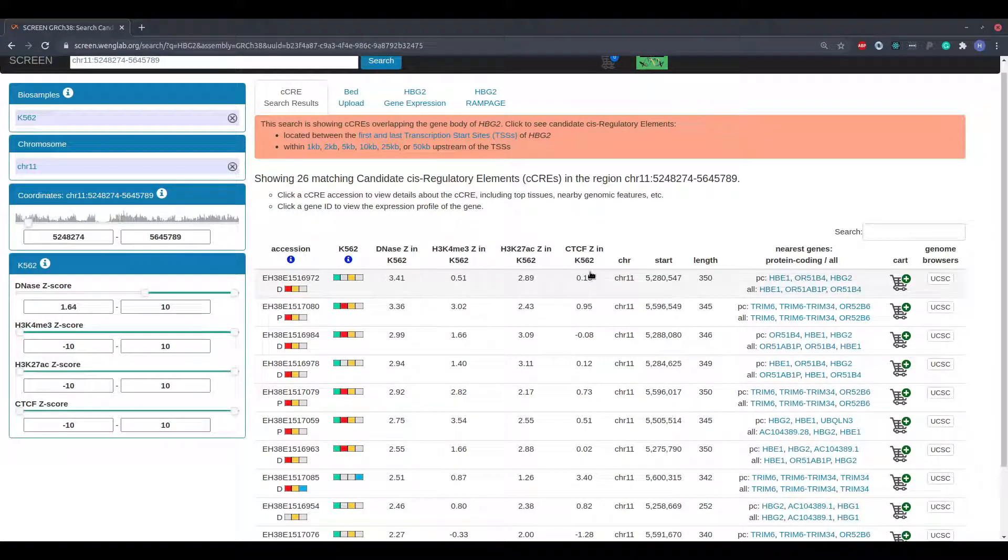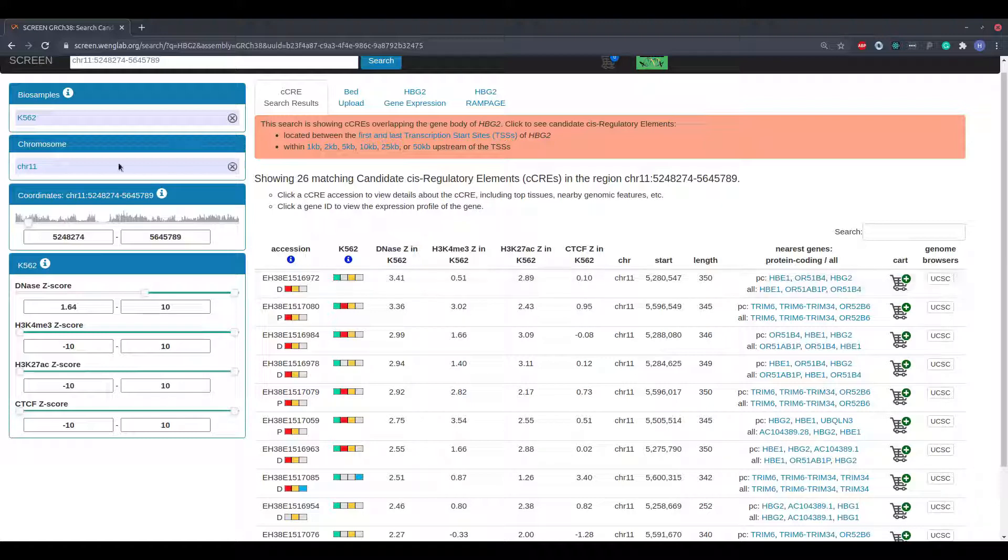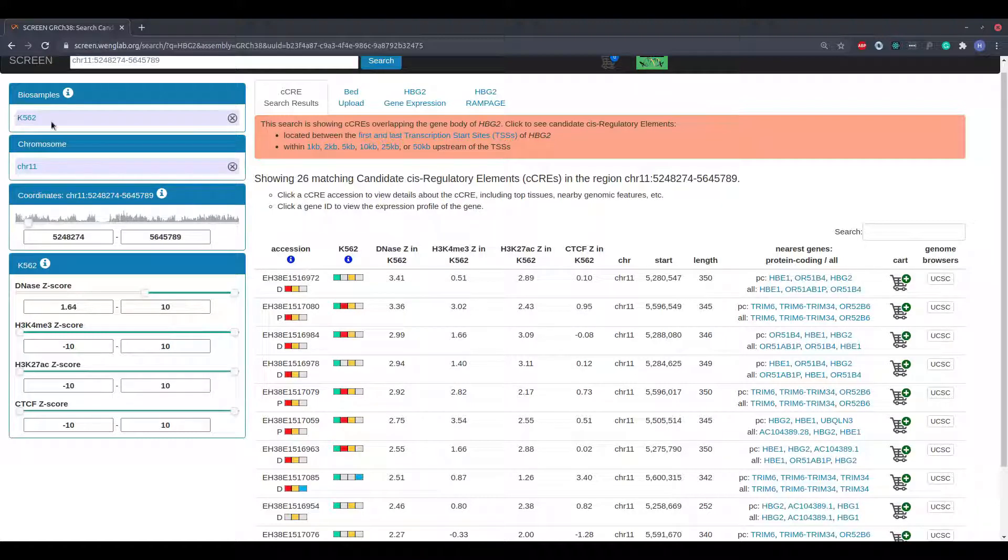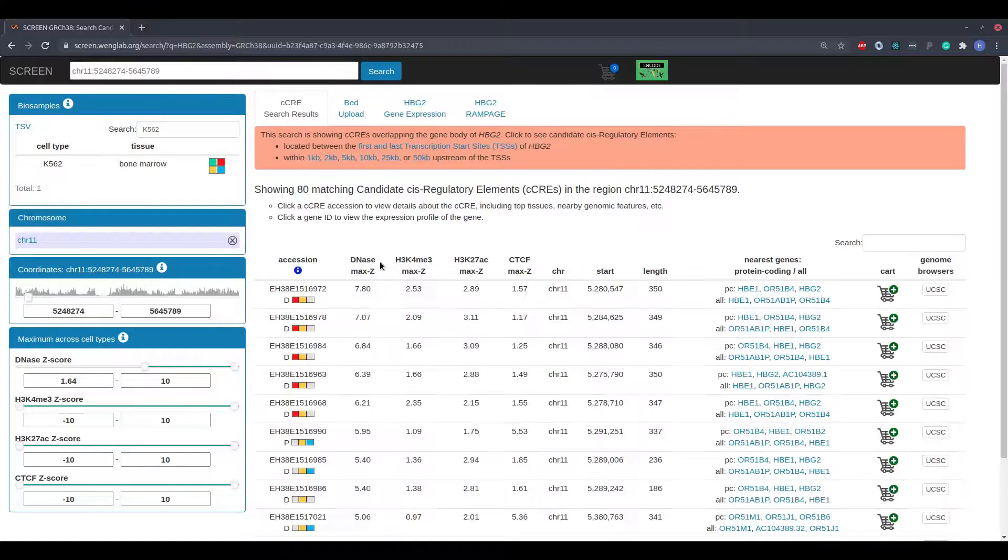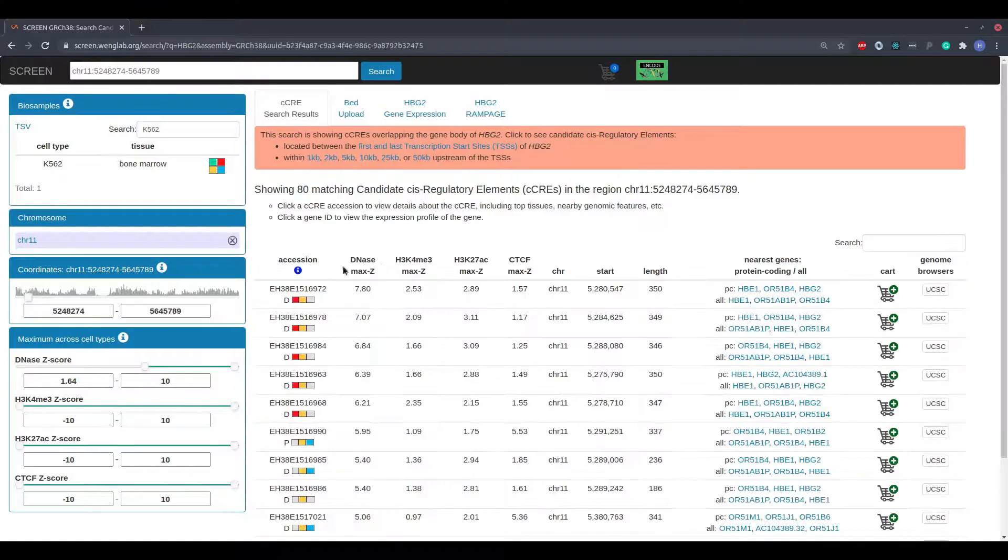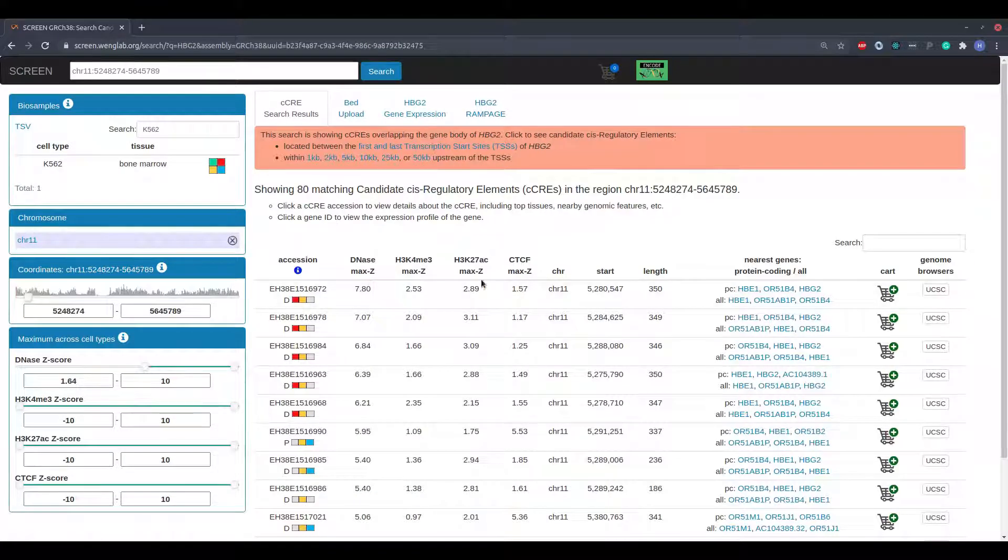When a cell type is selected, these columns display the Z-scores for the selected cell type. When no cell type is selected, these columns display the maximum Z-score for the given mark across all cell types.